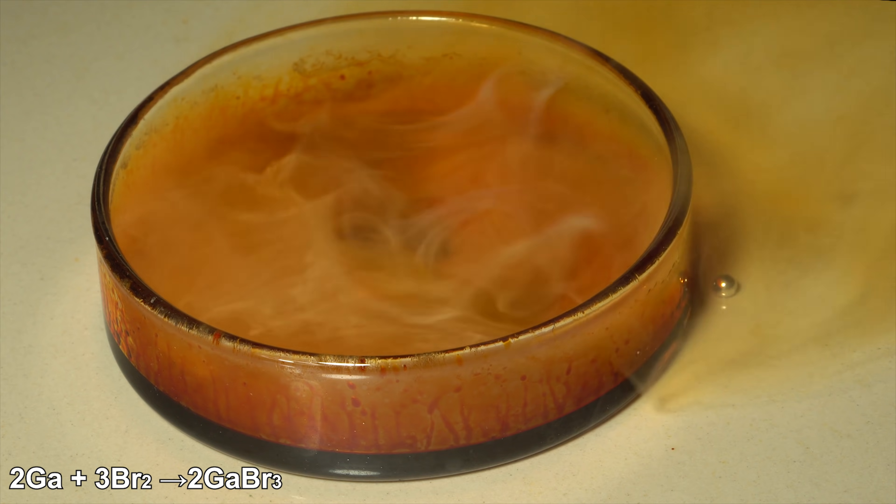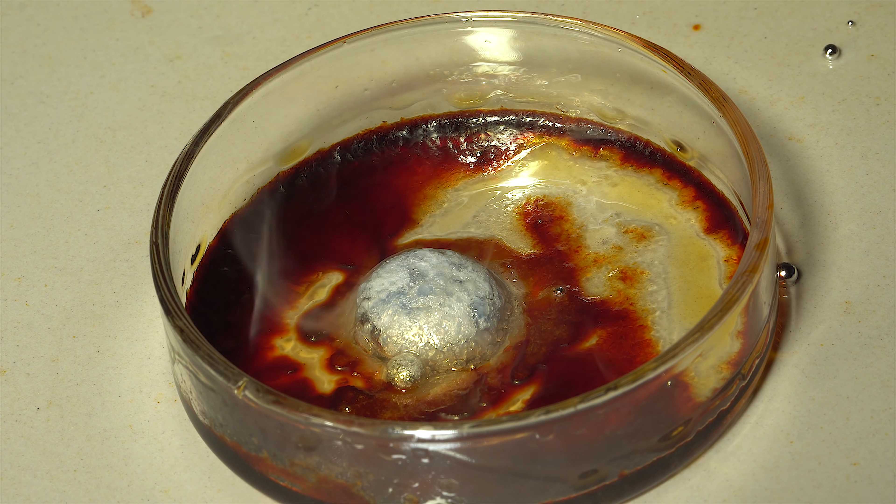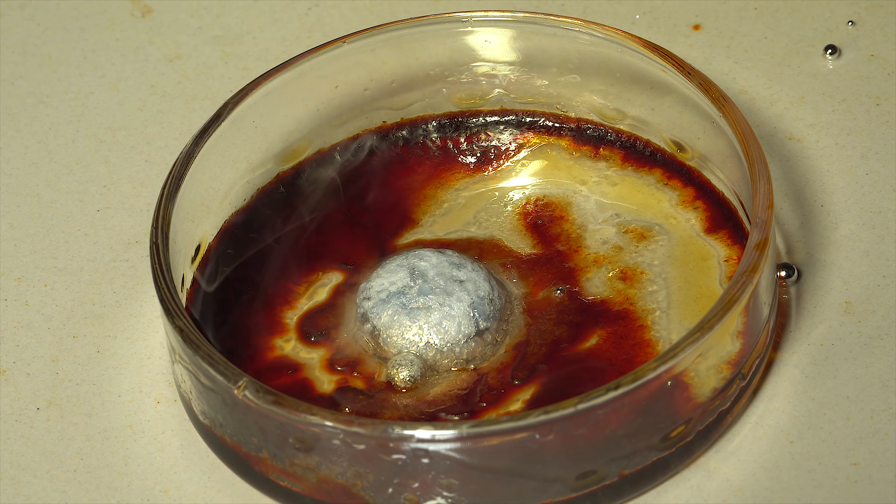You can see its crust on the surface of the gallium drop. Now I'm adding some water to dissolve the crust and reveal the gallium surface.